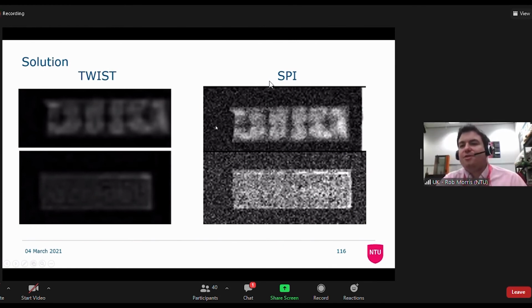So if you have long T2s, it's much better to use the rapid imaging, and it gives you really pretty pictures and you can average them and they look really beautiful. But actually for stuff with short relaxation times, chocolates and those kind of things, you're somewhat limited to pure phase encoding spin echo sequences, which just take a bit longer to run.